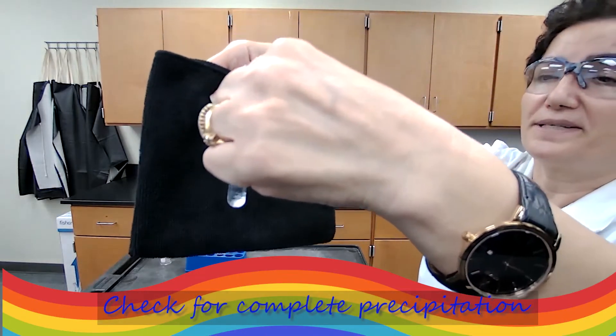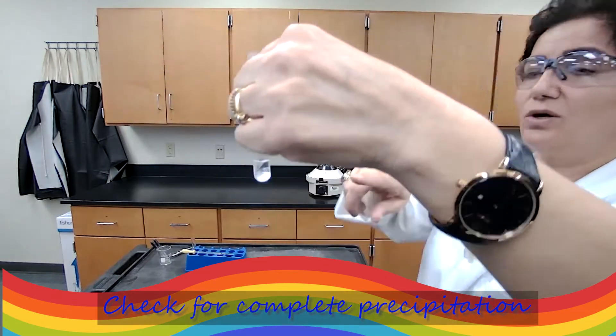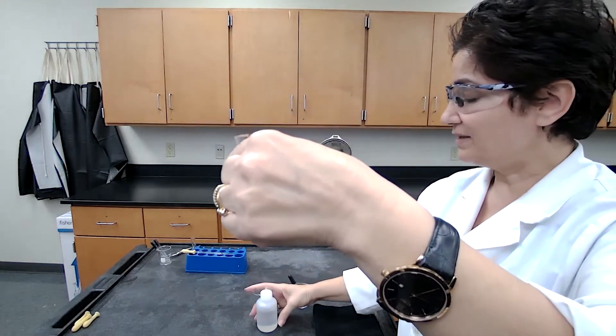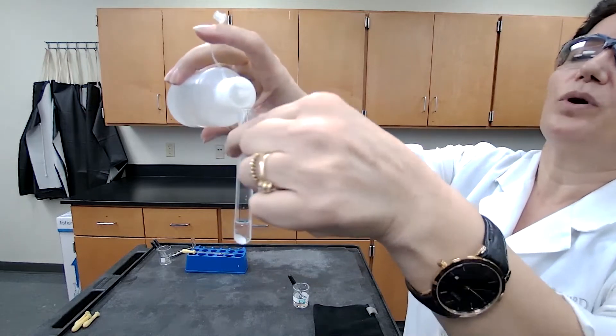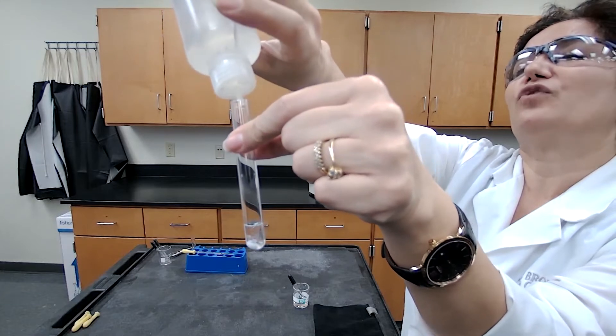To test for complete precipitation, we want to make sure that there is no cation left in the solution. I'm adding the reagent that I used before, which is HCl. I add one extra drop to see if new precipitate forms.